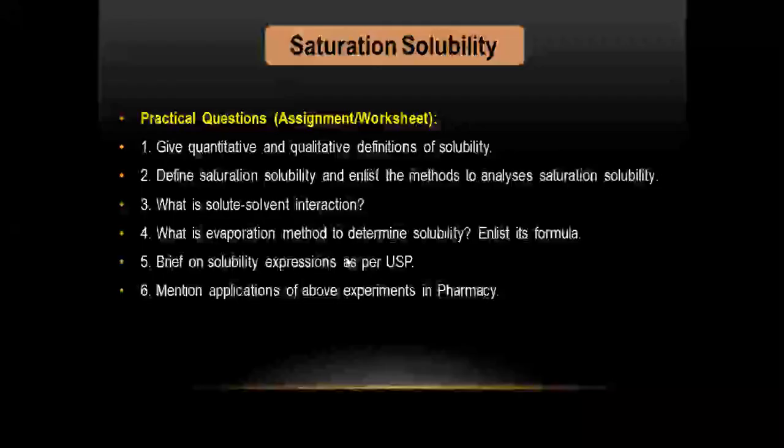The questions under this experiment are: first, give the quantitative and qualitative definition of solubility. Second, define saturation solubility and enlist a method to analyze the saturation solubility. Third, what is solute and solvent interaction? Fourth, what is the evaporation method to determine solubility, and enlist its formula? Fifth, briefly describe solubility expression as per the USP and mention the application of the above experiment in pharmacy. The answers to all these questions you will get in this video.